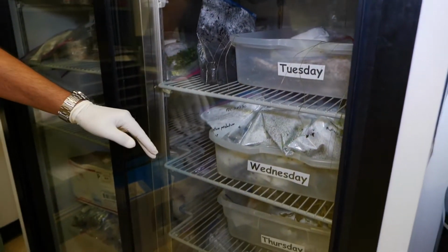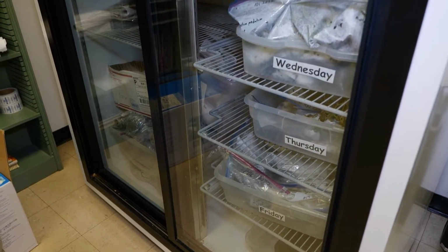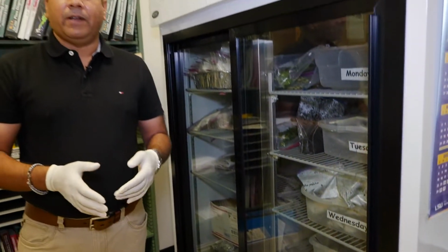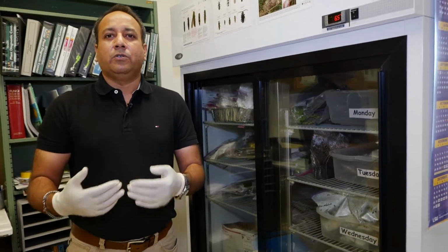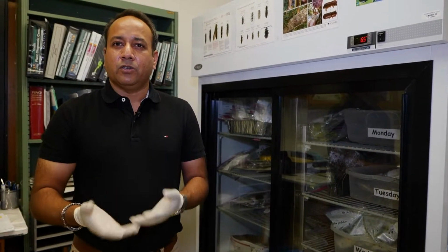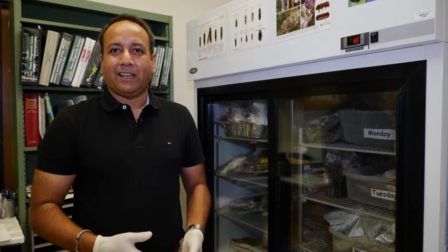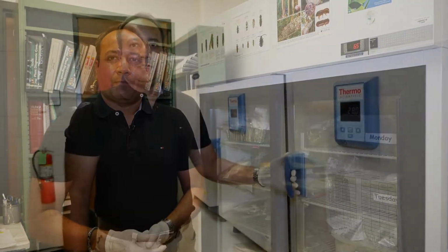And some days you get more samples, some days you get fewer samples. But we generally recommend that if you are interested in submitting a plant sample, you do it early in the week, so we have time during the rest of the week to diagnose the problem. Your sample doesn't have to sit over the weekend here at the Diagnostic Center in order to be processed.